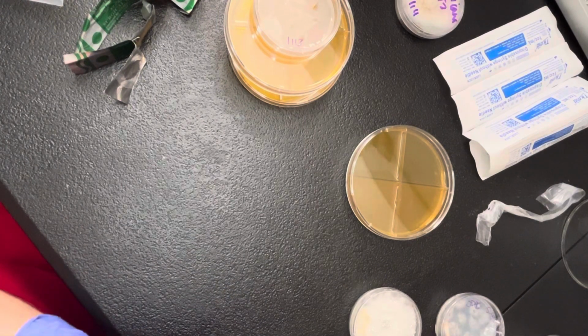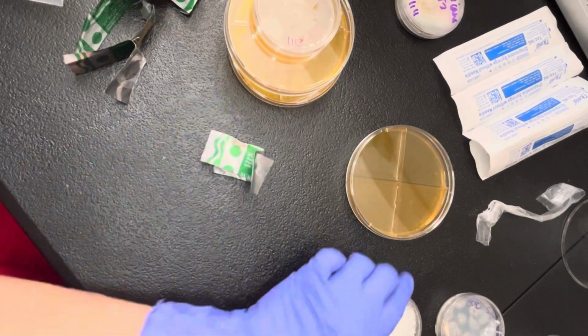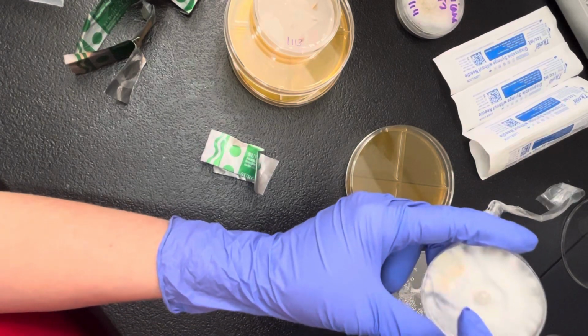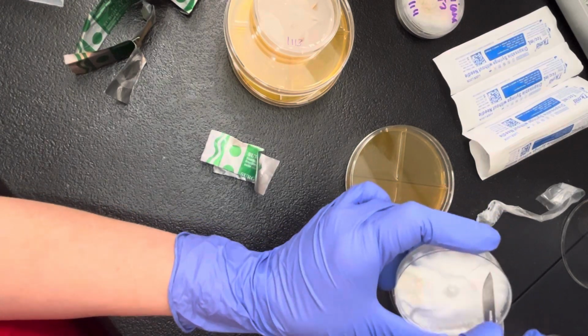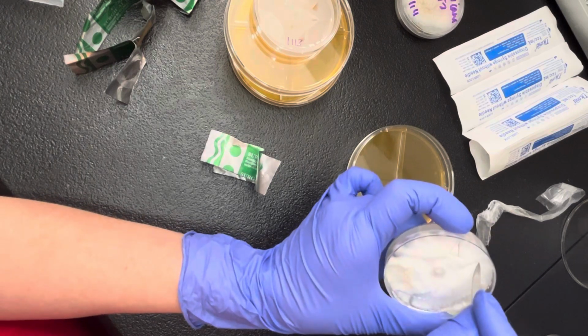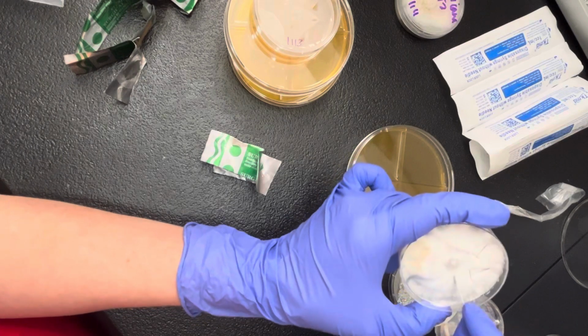So this is a P-sub, Saber Nigosa. It is an exotic strain. It's starting to get a little bit of a yellowing here. I'm actually just going to take a couple quick pieces of this and transfer it. And then I'm going to be going to grain with this.